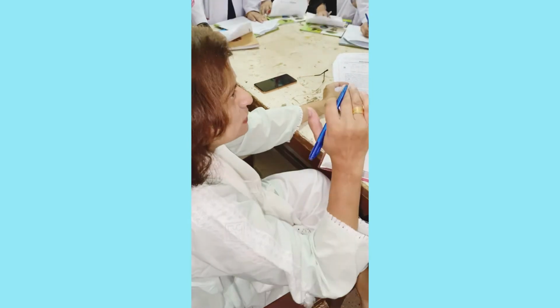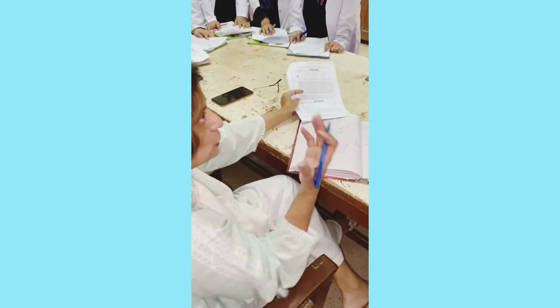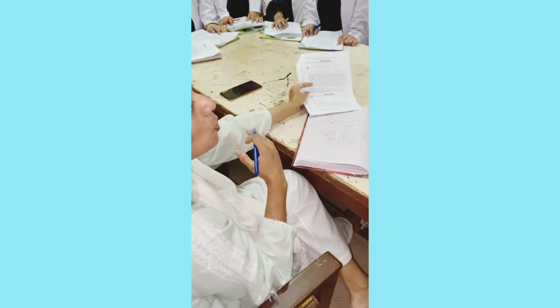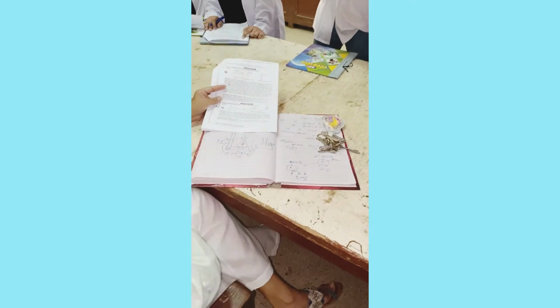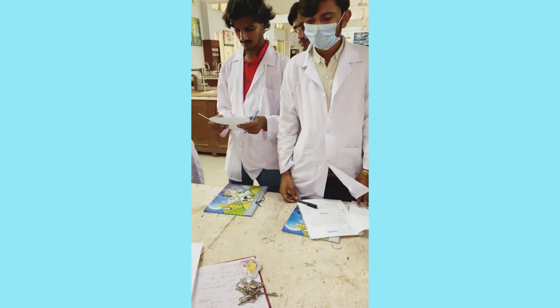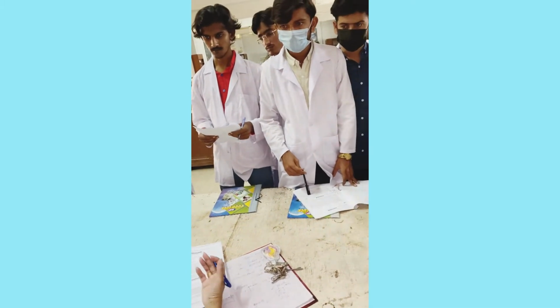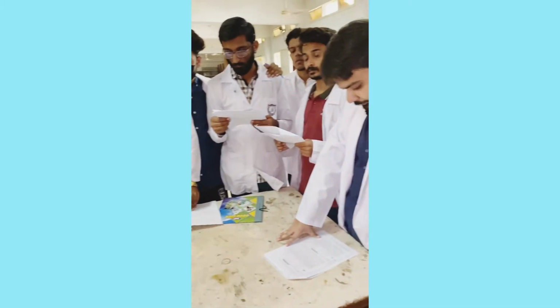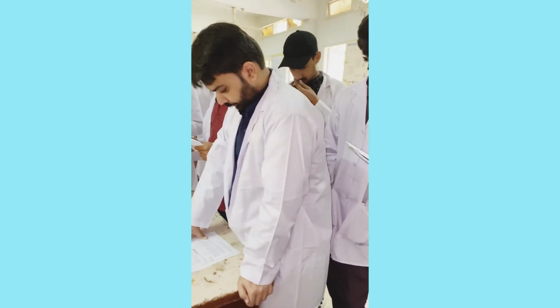If the temperature goes up, just add some more ice or cool water, right? So that the temperature does not go above 10 degrees centigrade. Otherwise you will spoil your product, it will not be formed at higher temperature. The higher temperature is going to ruin your synthesis process.